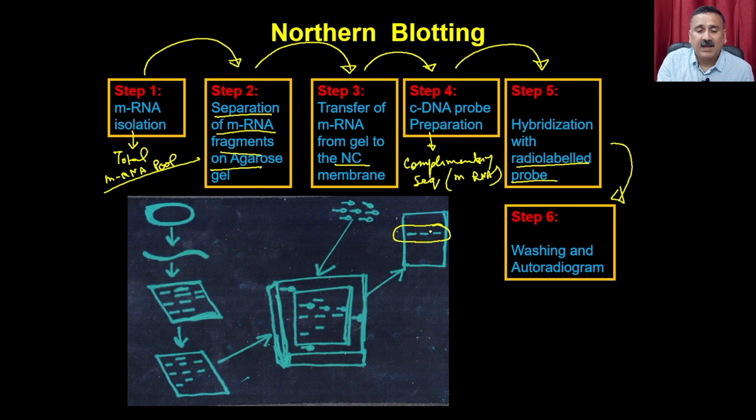on the X-ray film. And the intensity of these bands is actually going to give you the expression level, or the transcription, of that particular messenger RNA under the different experimental conditions.